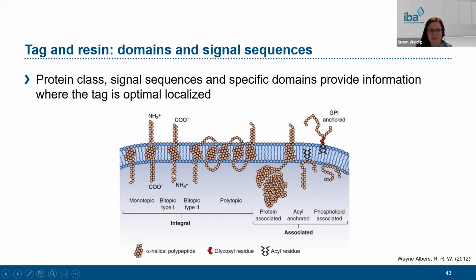So your protein could have a membrane domain, or you can have a protein which is partially secreted via the N terminus, or you have a protein which is partially secreted via the C terminus. And during the secretion, the signal sequence which is at the N terminus or at the C terminus will cleave off.